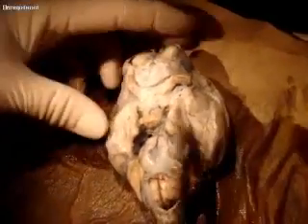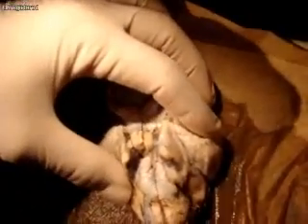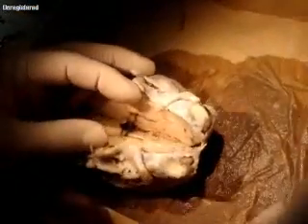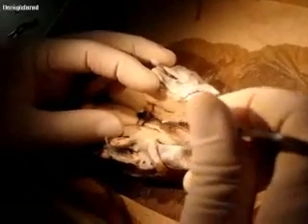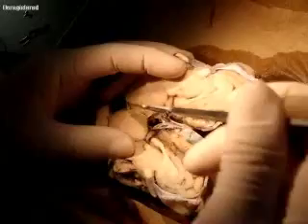So I'm going to go ahead and cut this. And I can tell you right now that some of these are really mushy. So you can see I'm just doing a mid-sagittal section, or as close to mid-sagittal as I can get. Kind of trying to go through the longitudinal fissure if I can. I missed it by like a micrometer.